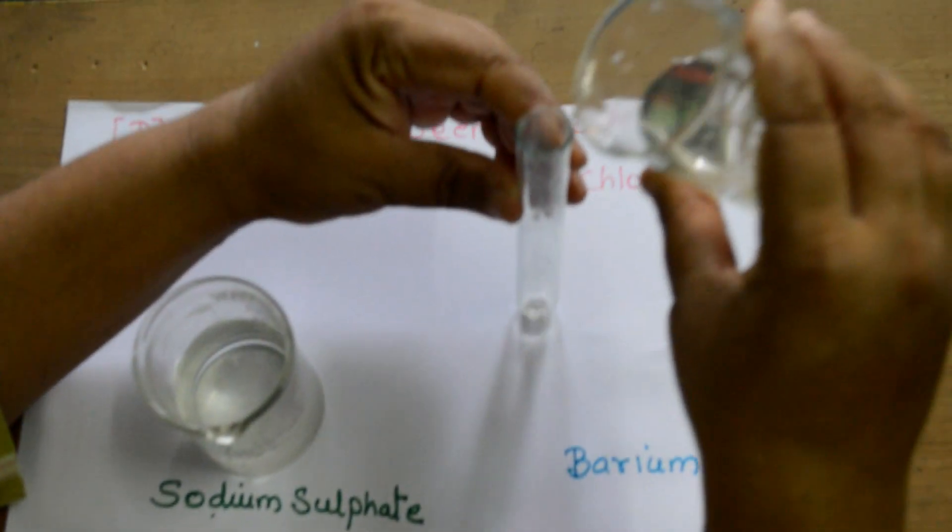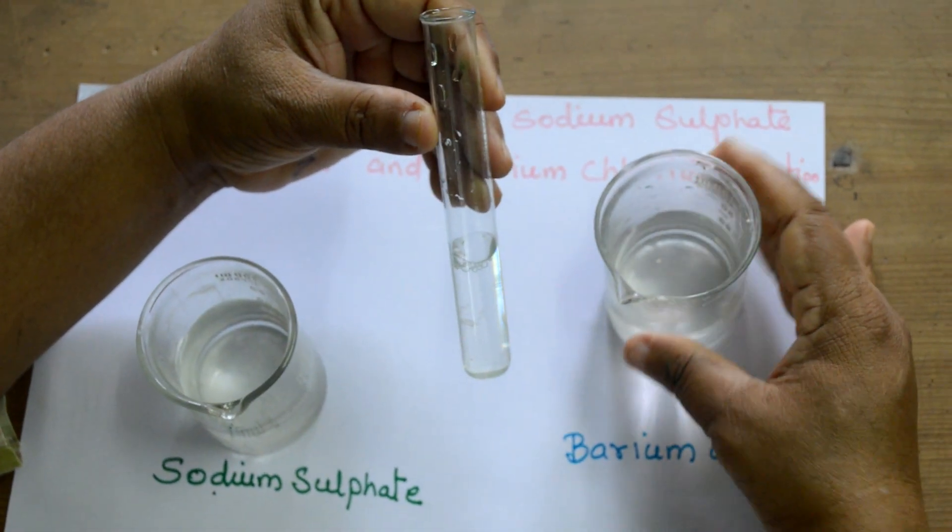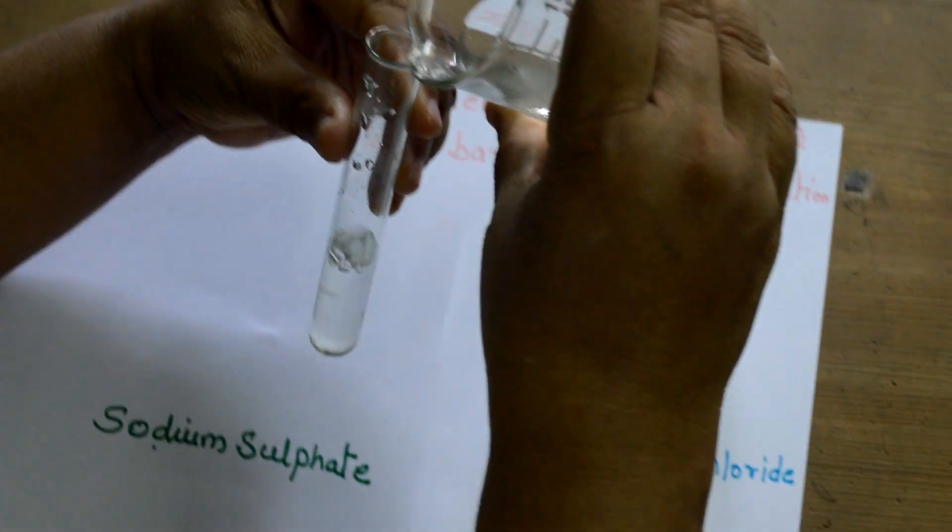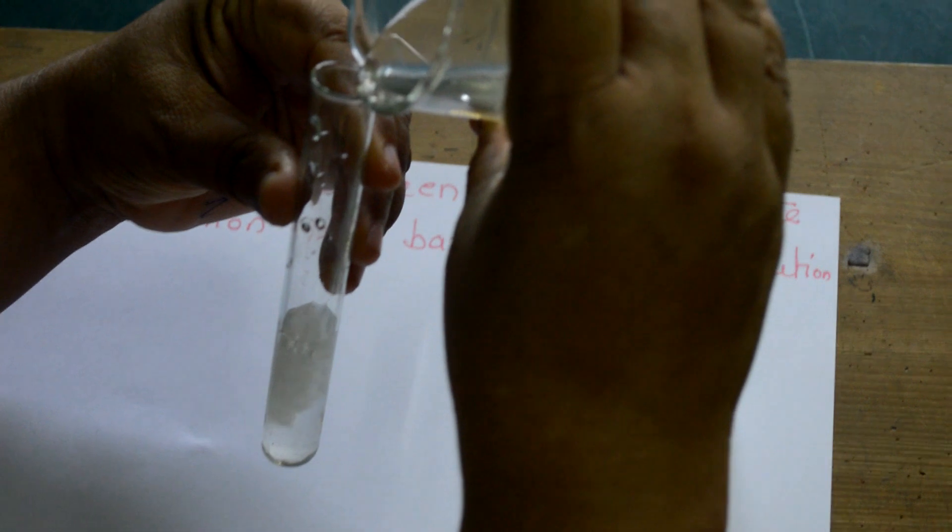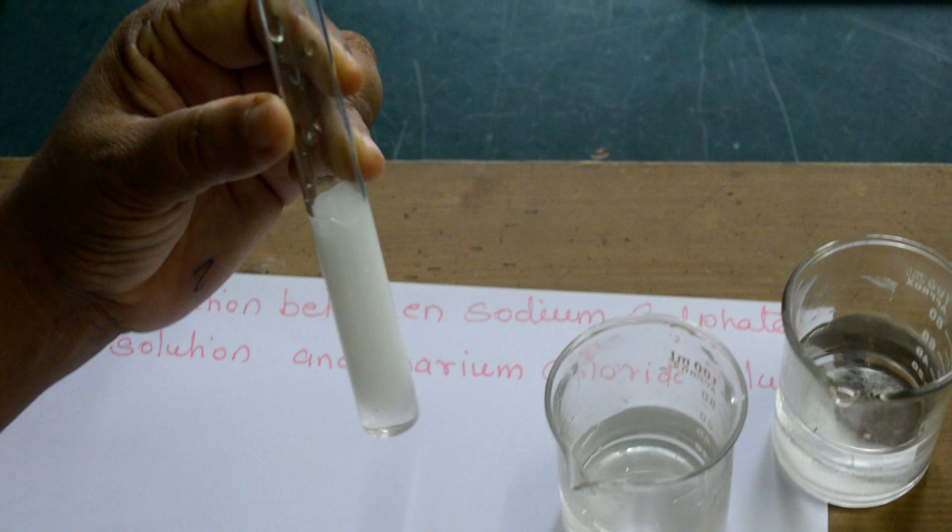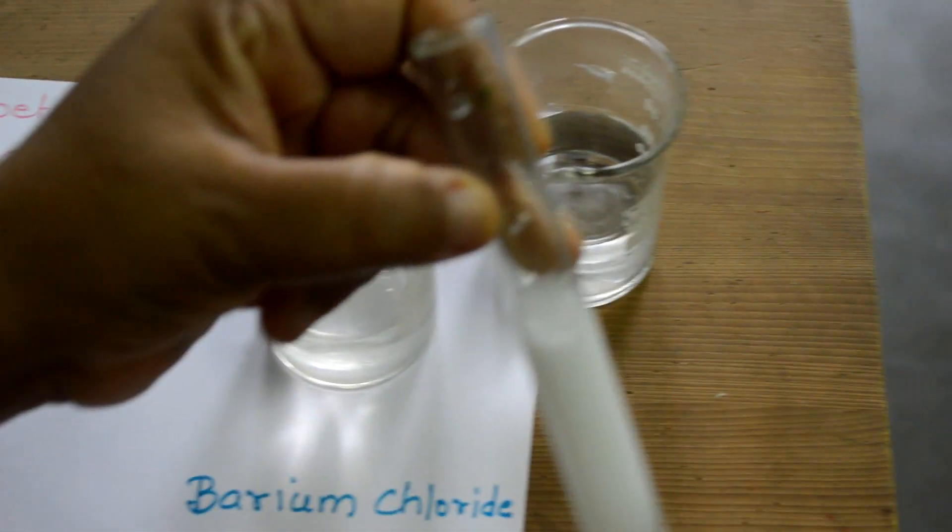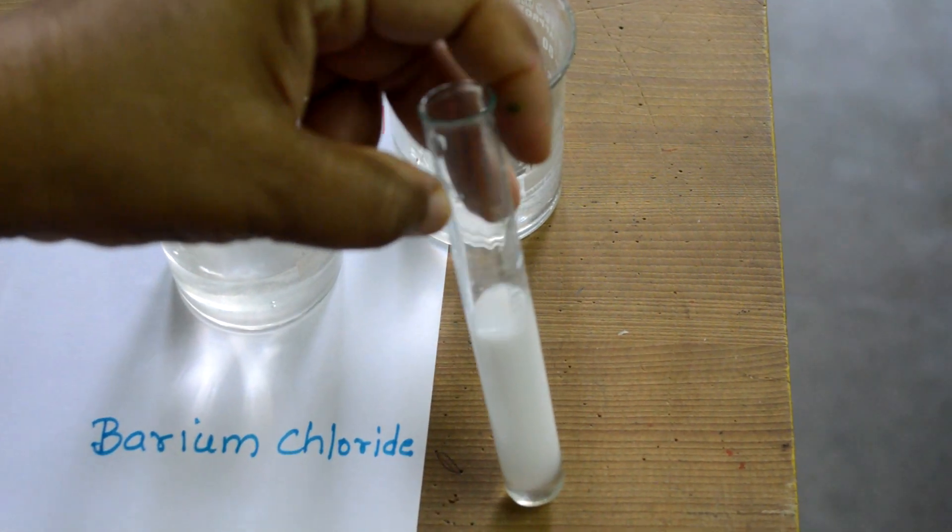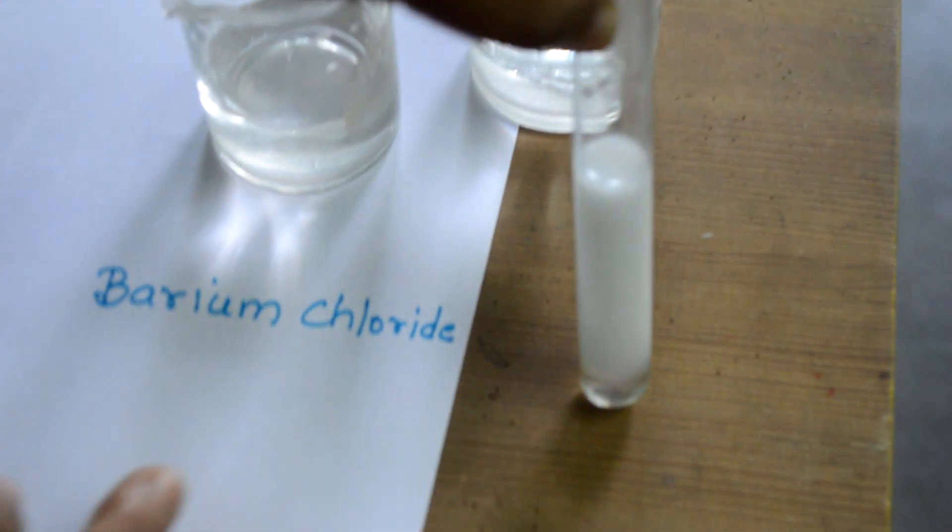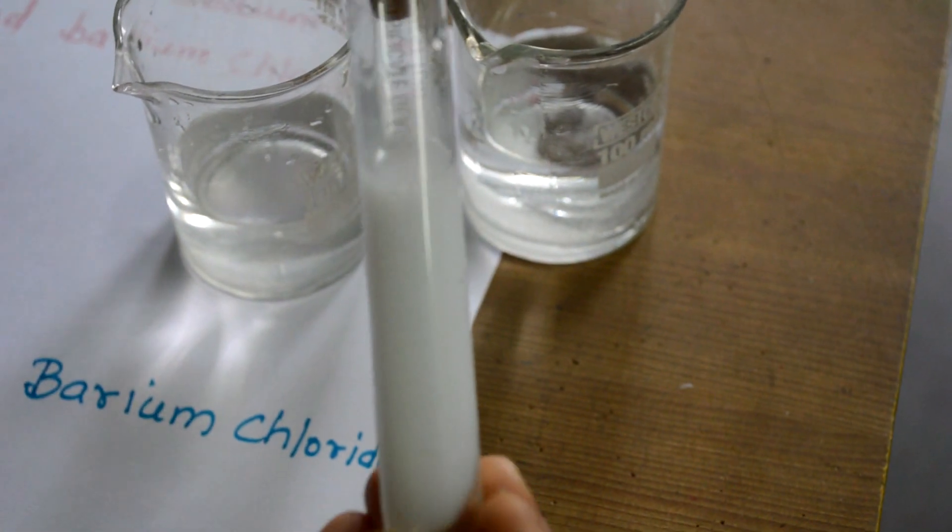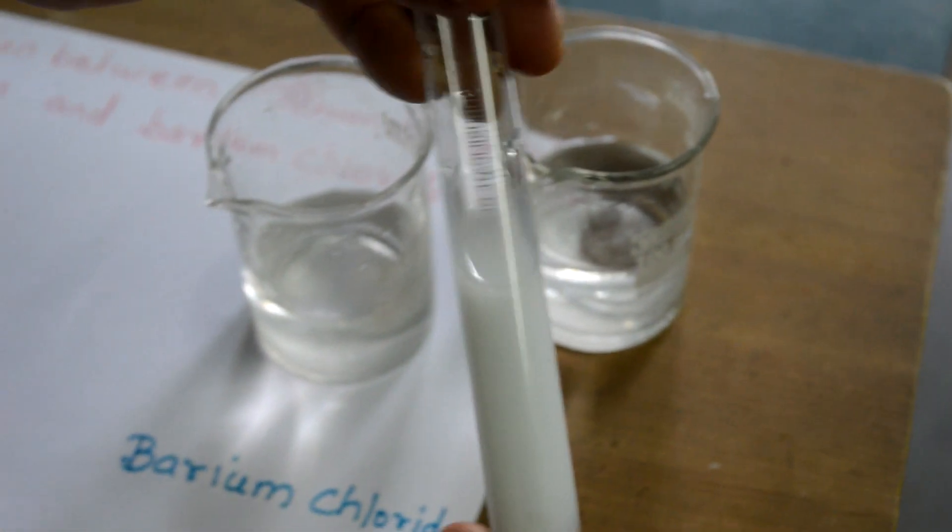Take 5 to 10 ml of barium chloride in a clean test tube and pour equal amount of sodium sulphate. See, immediately you can see the change. The solution has turned white. White precipitation has formed in the mixture.